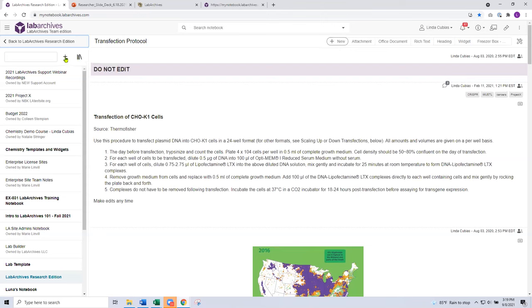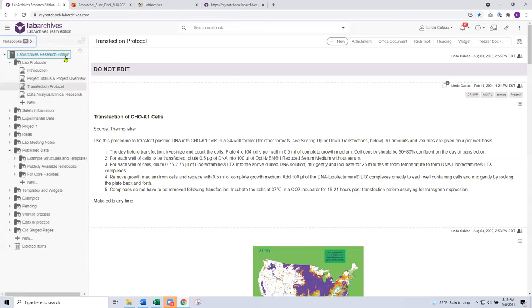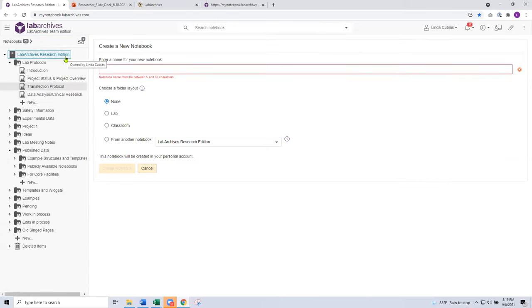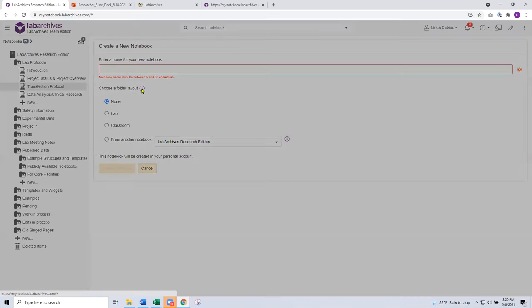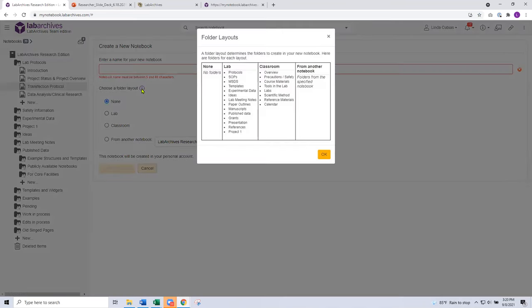It's also here in the notebook manager where I can create a notebook, which is a great first step for all of you today, especially those brand new to Lab Archives. After you create your account, create yourself a notebook. Remember, you have access to unlimited notebooks — create one just as a sandbox or playground, your first notebook to try out. When you go to create your notebook, it's a very simple process where you give your notebook a name and choose your folder layout. The folder layouts are optional, with no layout as the default, but we do have sample layouts available.